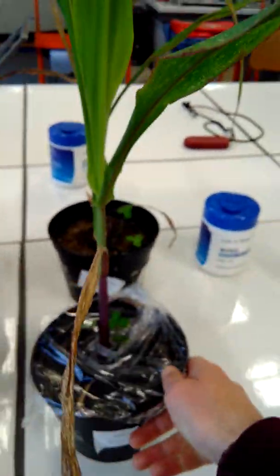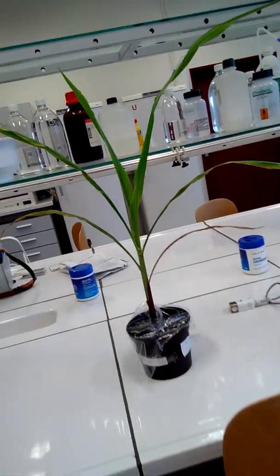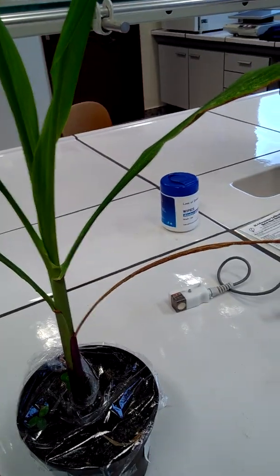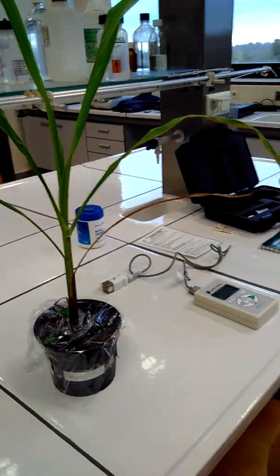And once we've done that, the leaves have names. You don't need to write them on the leaves, but you need to make sure, by discussing with your fellow students, that you know which leaf you're working on. And why that's important is, for example, I'll show that in the next clip.